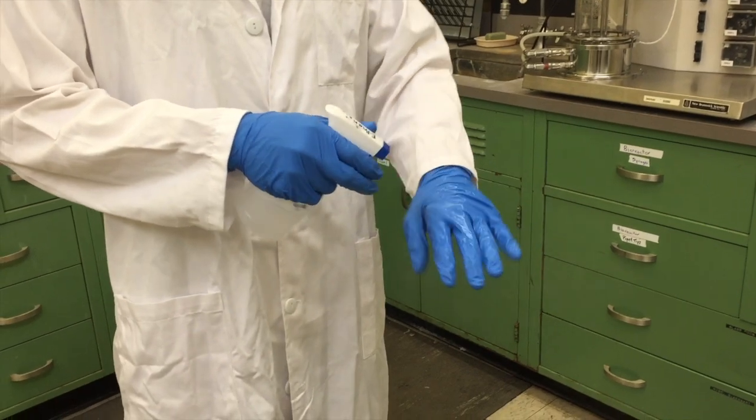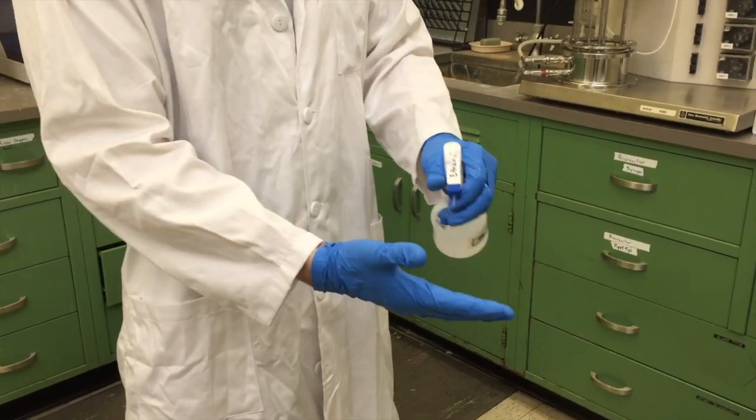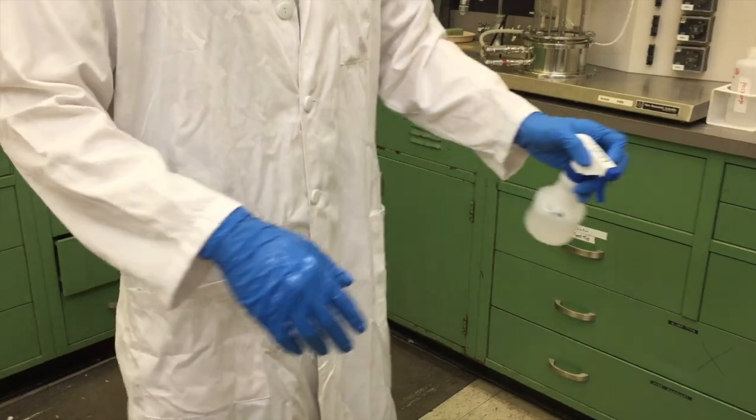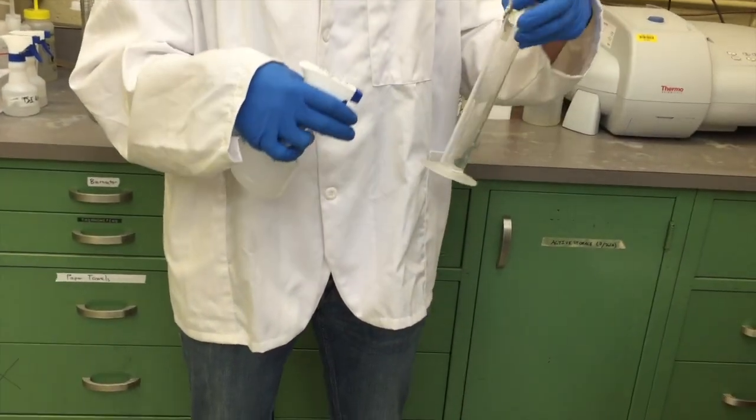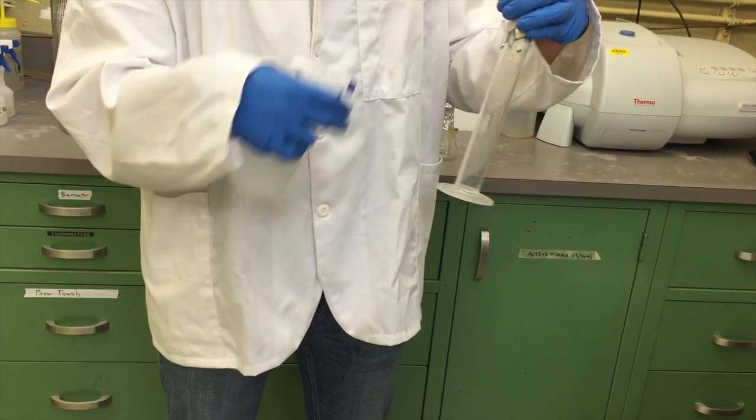In order to keep the fume hood and other working surfaces sterile, spray down gloved hands and glassware with ethanol before use. When finished with the work area, spray down with bleach, ethanol, and water.